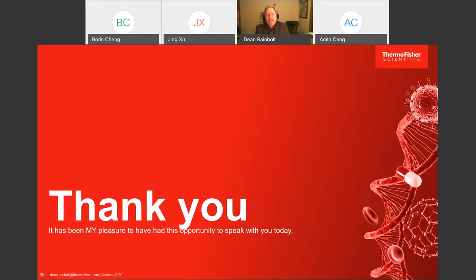I would say the other mistake would be, I'm trying to think now. The documentation piece is so much. The whole laboratory preparedness. When I walk into a laboratory, I'm going to check every label. I'm going to check every sticker, PM sticker. I'm going to look at all your chemicals and make sure they're not expired. I'm going to look at the cleanliness, and I'm also going to look at the maintenance of the building procedures. So usually I will always find something wrong in a lab. They're not showstoppers, but it's always something to watch.